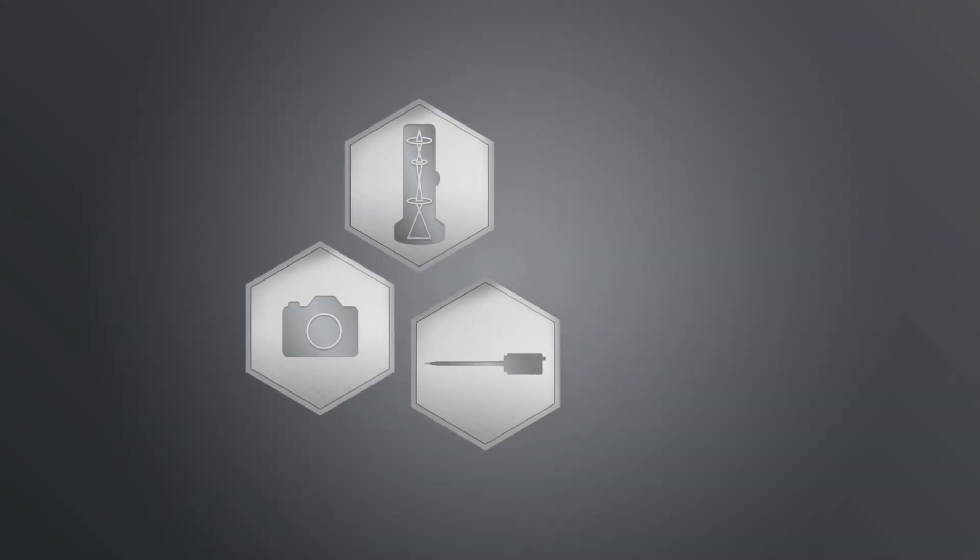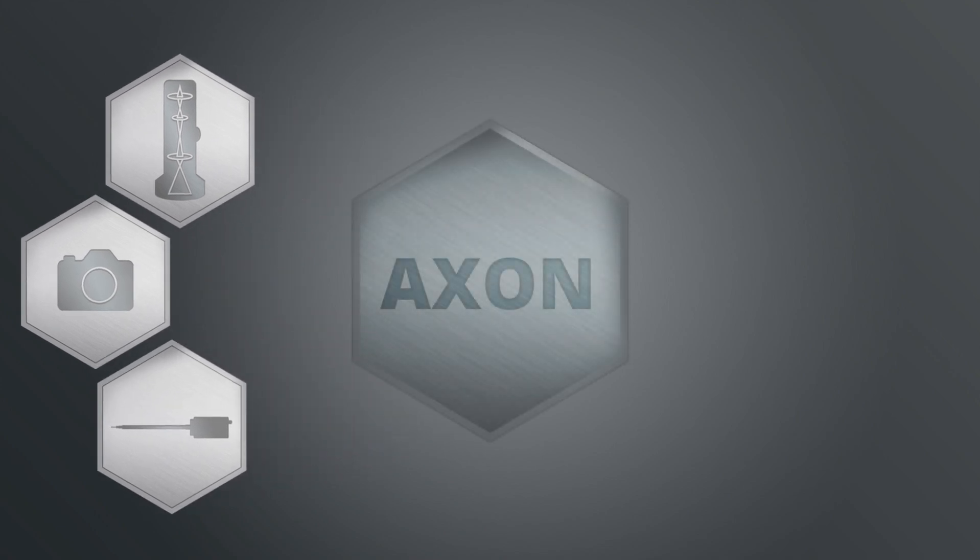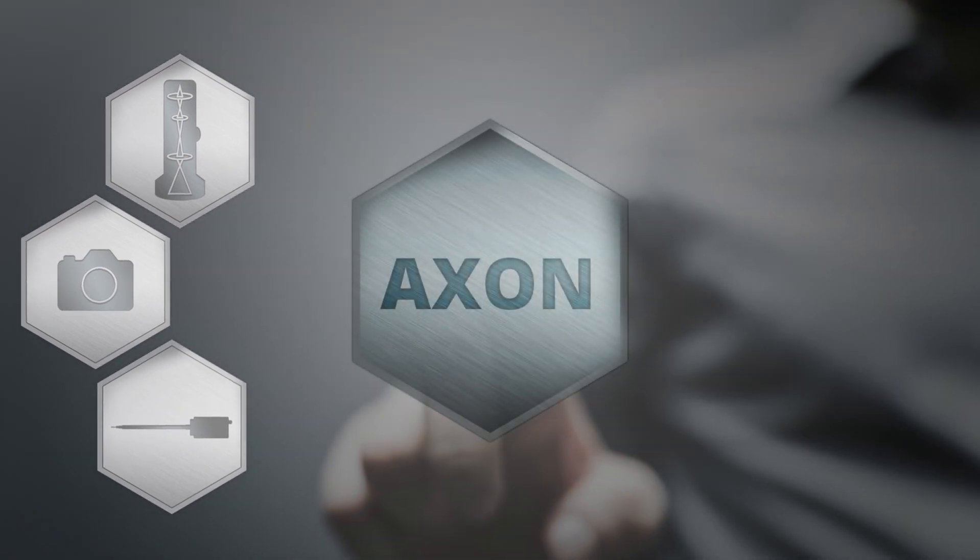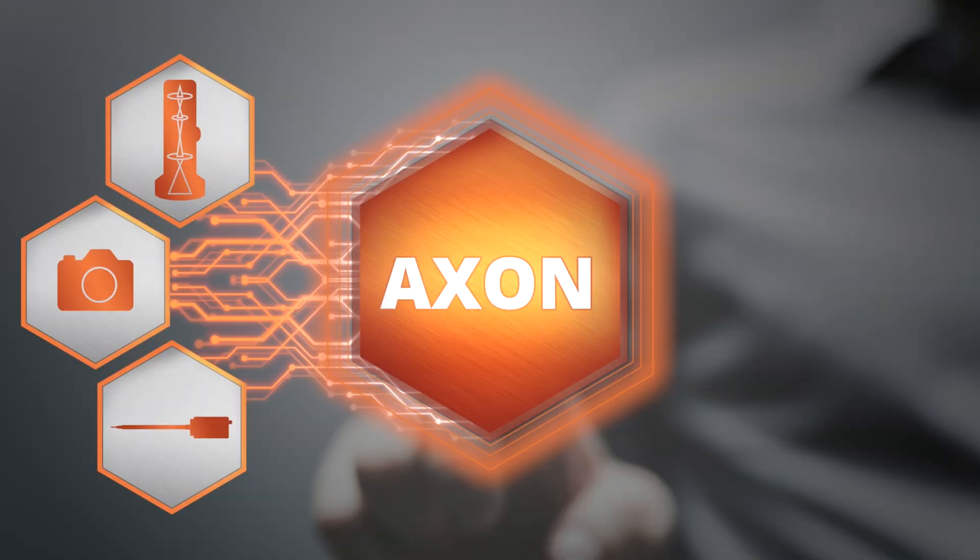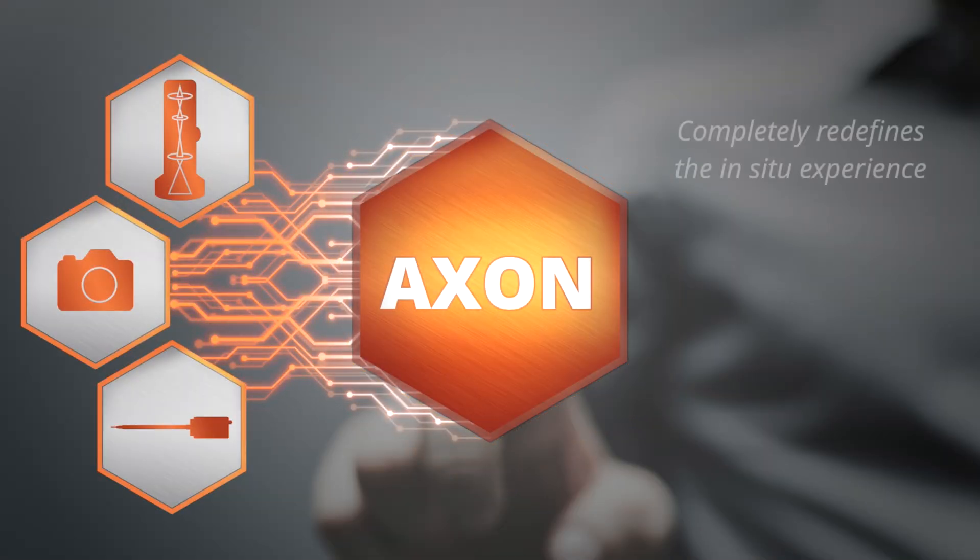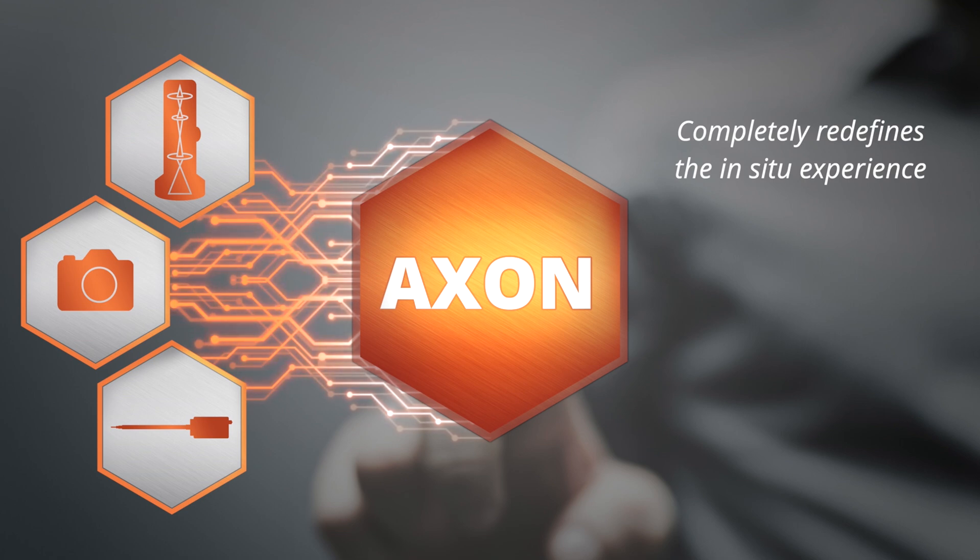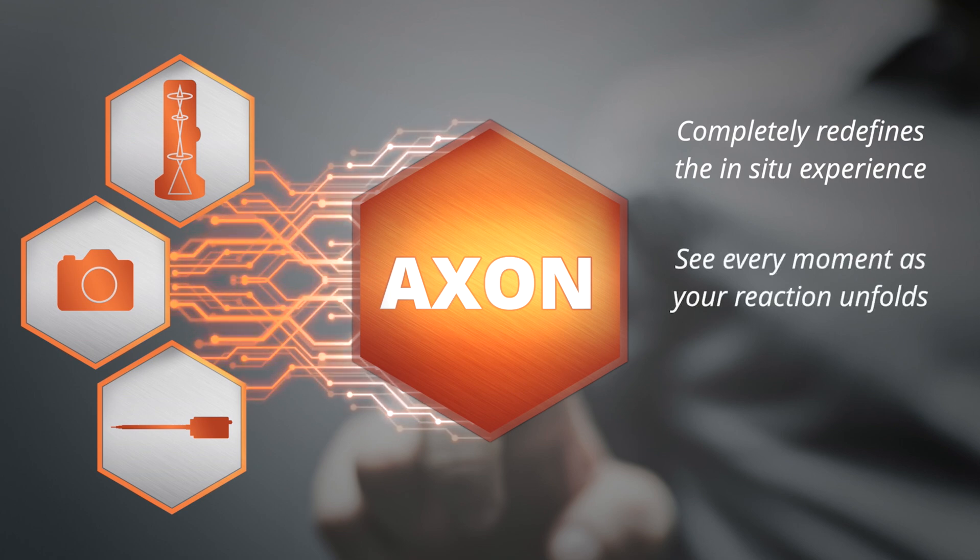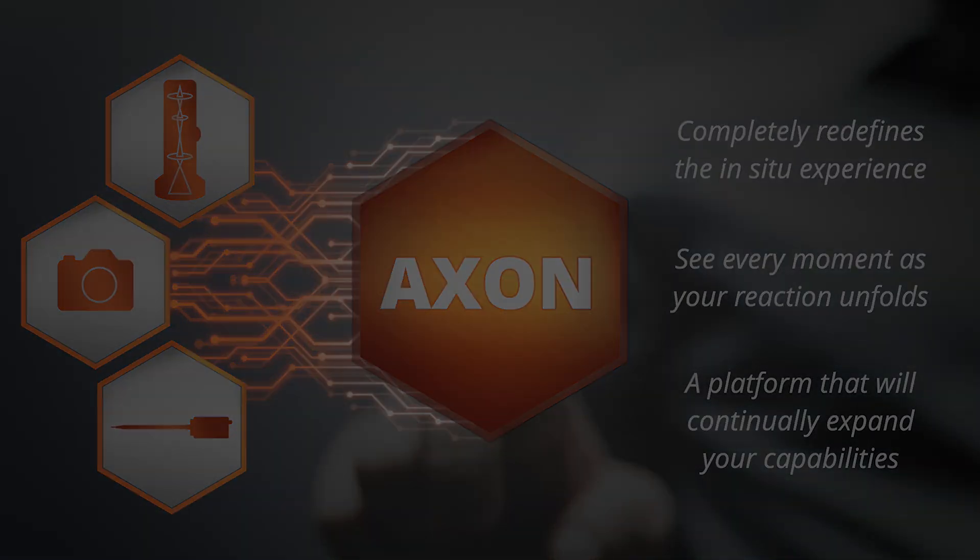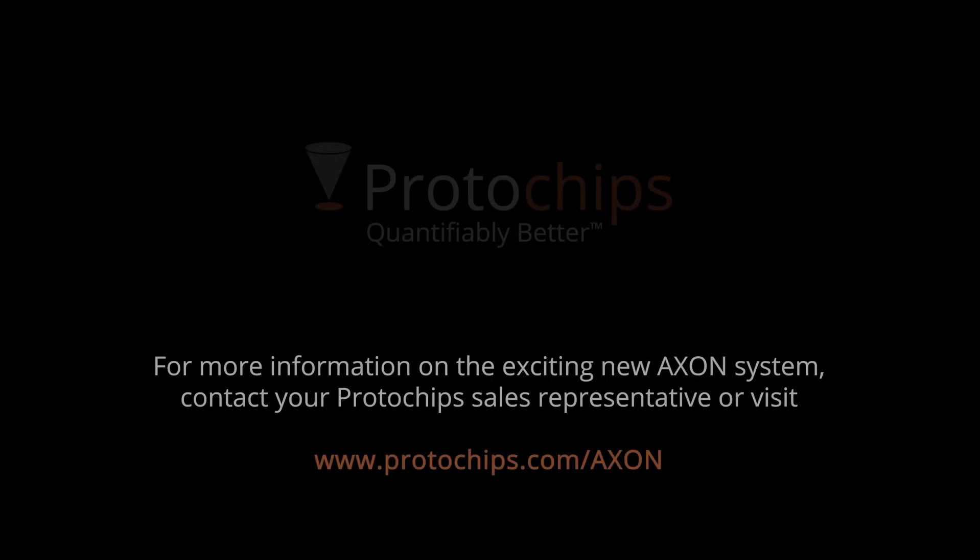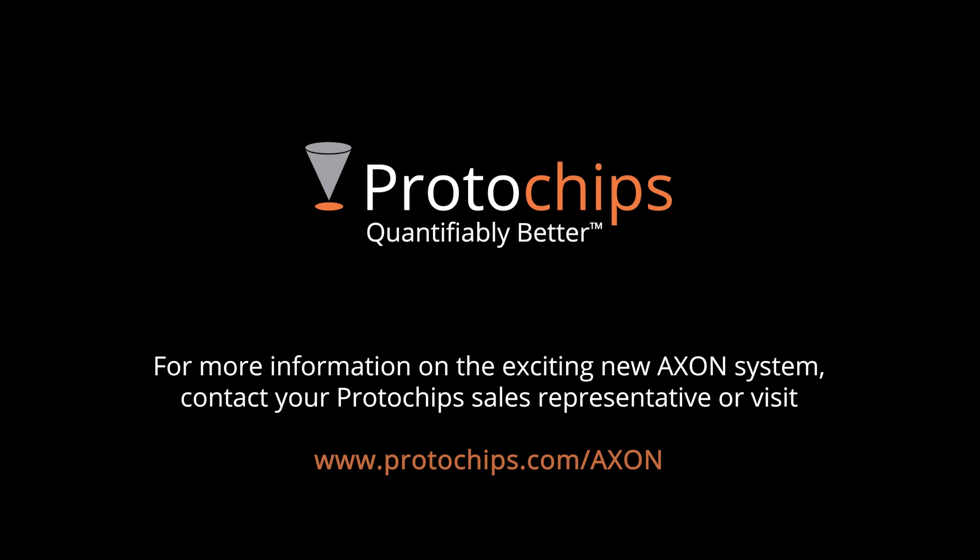Axon connects all the major components of your system in an intelligent network, lowering the barrier to entry for new TEM users while automating and streamlining the workflow so all users can deliver higher performance results far faster than ever before. And this is just the beginning.